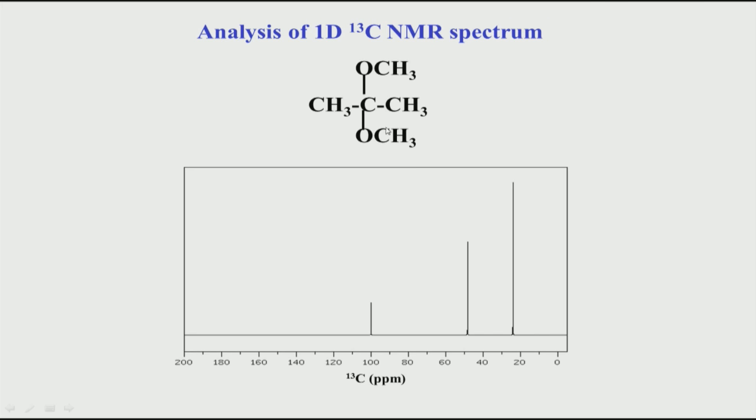So, therefore, the CH3 also comes somewhere between 0 to 20, but 0 to 20 will not hold if there is an oxygen attached. So, again if you look at that chart which we had seen earlier, it was somewhere between 50 to 100 ppm given for the OCH2 or CH3, and this is basically coming from there.